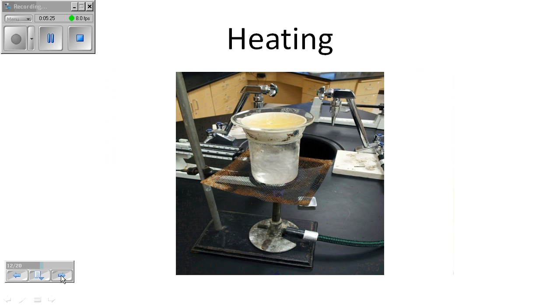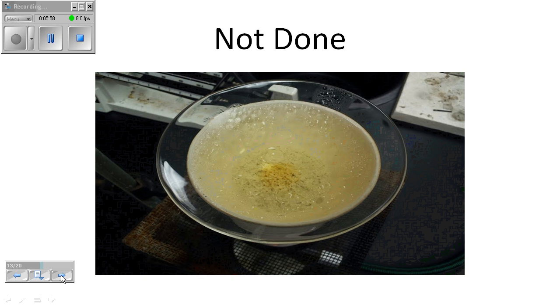So here is a picture of the reaction that I've placed up on top of the water bath. I have the heat going underneath it. You can see the water boiling in the beaker, and it is heating the evaporating dish. The idea here is mostly that we are going to finish up any reaction that isn't done, and we're going to start to dry out the stuff that's inside of the evaporating dish. We're going to do this slowly and gently at first, so that we don't lose any of the stuff that's inside of there.